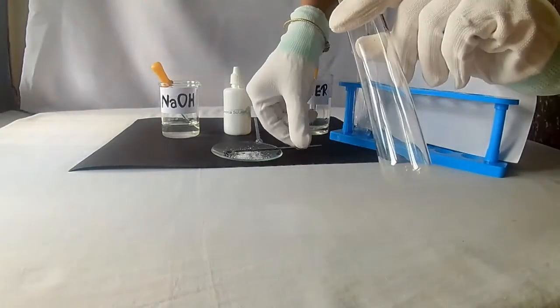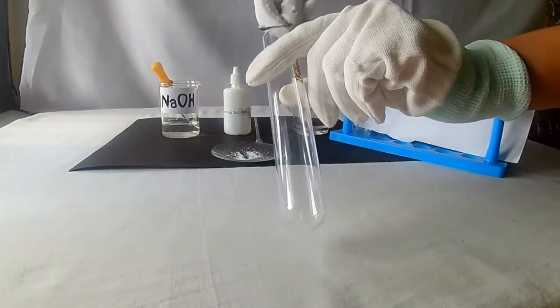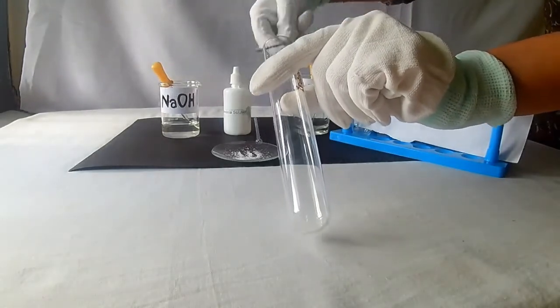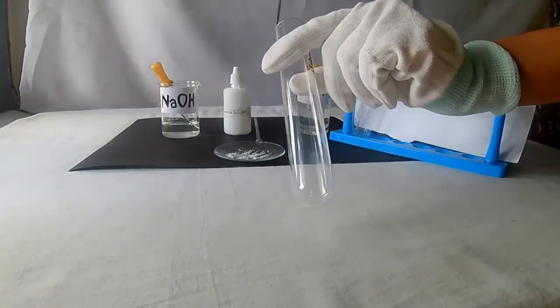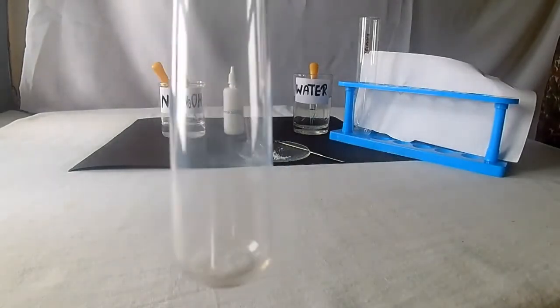Now add the salt into the test tube. Be careful while performing the experiment. Use the apparatus carefully. Now the salt is ready.